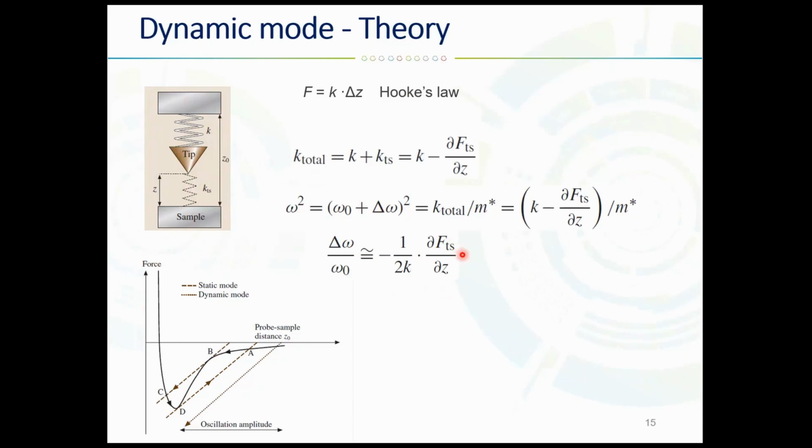Even though this consideration is based on a very simple model, it shows us qualitatively that in dynamic mode, we will find that the oscillation frequency depends on the force gradient, and in principle we can calculate the force curve from the force gradient and vice versa. That's why I spent so much time on different curves showing you like last time.